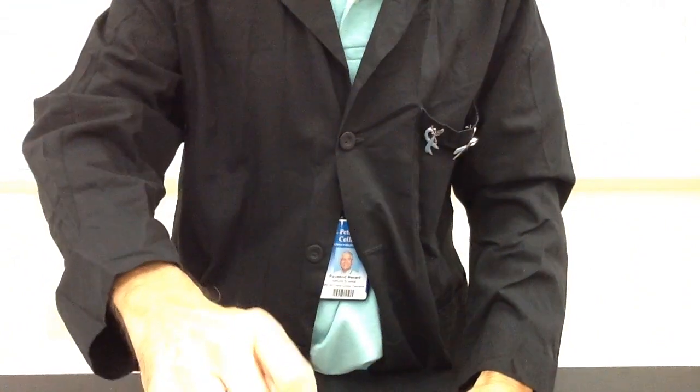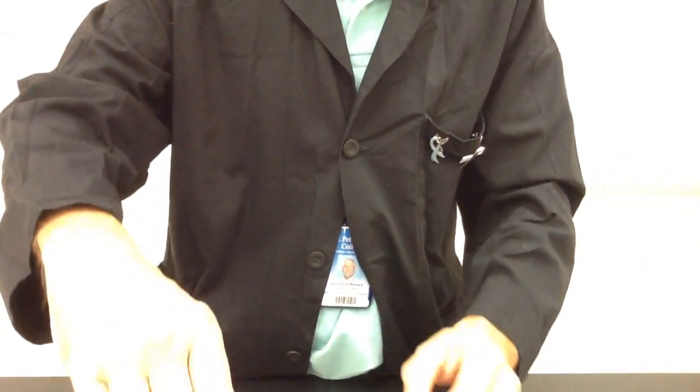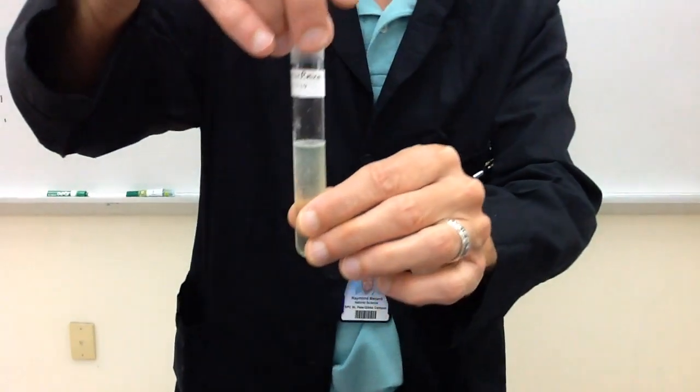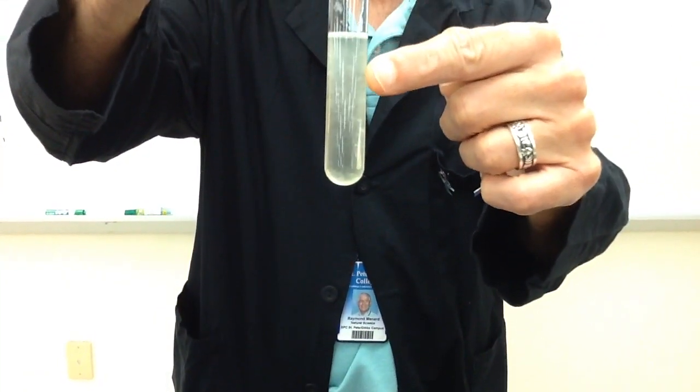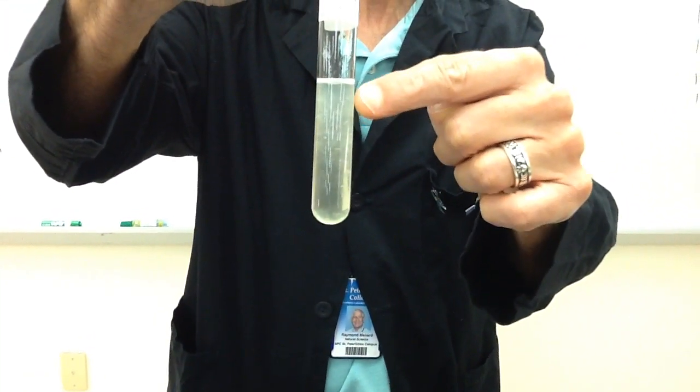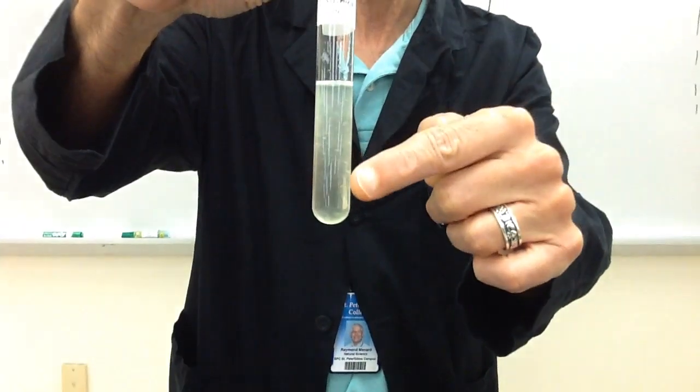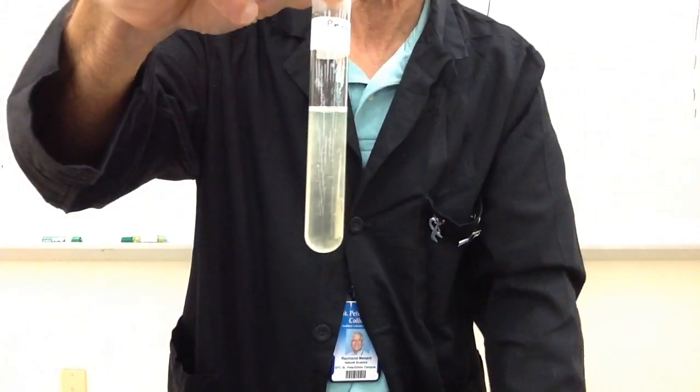The next one that we have is going to be a facultative anaerobe, and this is Proteus mirabilis. What you should see is that it grows a little heavier at the top, and then it starts to grow all the way down to the bottom of the tube.